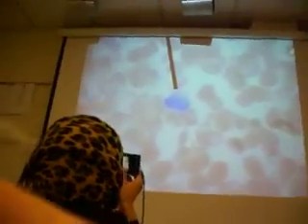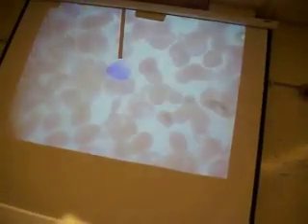And with monocyte, this is one of the agranulocytes. This is one of the ones where there are no granules in the cytoplasm that stain. All right? So you have this big nucleus, and it's one of the largest of the white blood cells. Okay? And with the monocytes, when they're active, they're referred to as a macrophage. Okay? So these guys are phagocytic. So the first thing you want to be able to do is identify that specific cell.